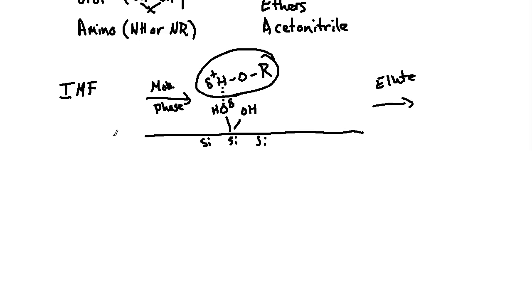So many times several different solvent ratios or combinations will be required for a little bit of a trial and error discovery process, like I stated earlier, or research and development, whatever you want to call it, in order to optimize the separation and the resolution of the HPLC results, because this is what you're working with here. You need to move these along in a fashion, breaking apart the localization at a sufficient enough rate that you're not going through boatloads of solvent.